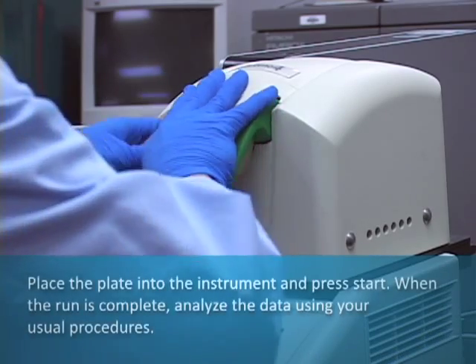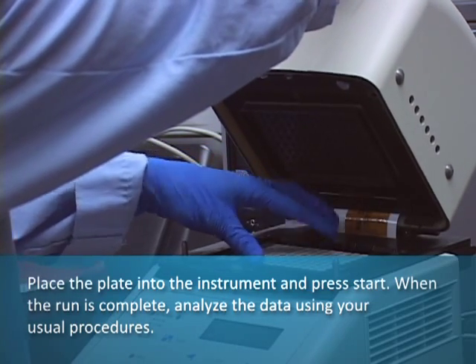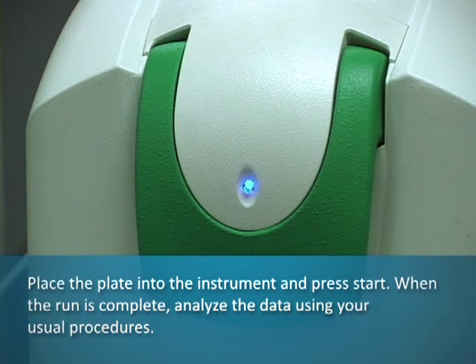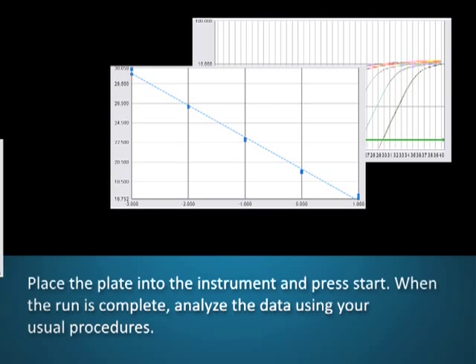Place the plate into the instrument and press start. When the run is complete, analyze the data using your usual procedures.